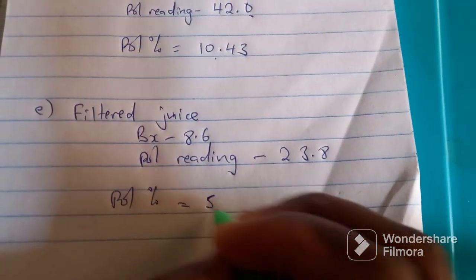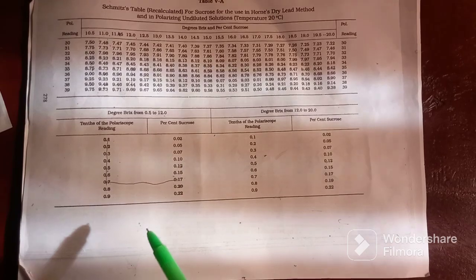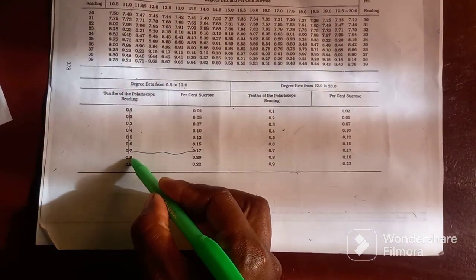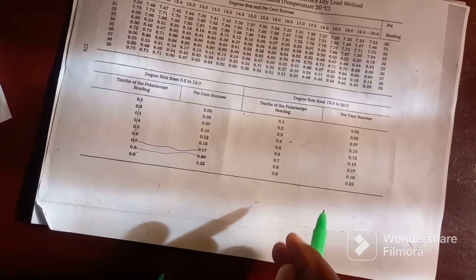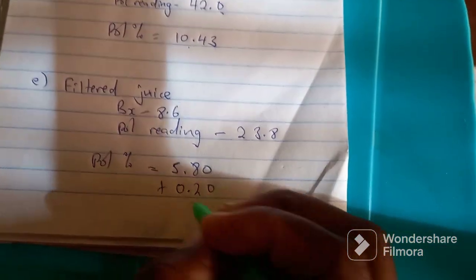So let's go to the table that will give you the pol percent of 0.8. Here it is. At 0.8, the value is 0.20. So you take 5.80 plus 0.20, you get 6.00. So pol percent of filtered juice is 6.00.